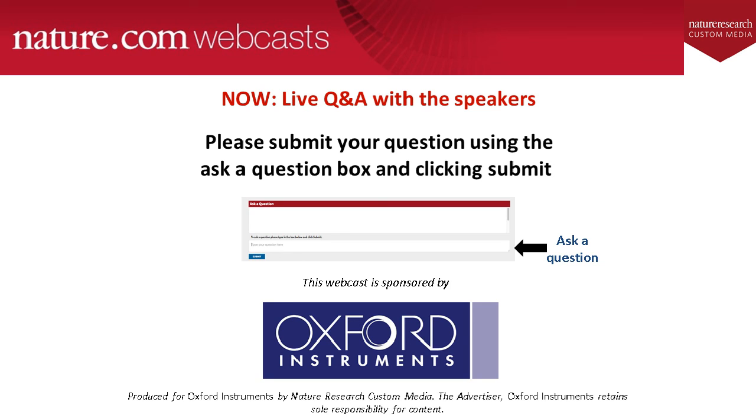So this, I think, is something I'd like to explore more. The example that I showed in the webinar was one where the APEX labelling was very strong. The osmium signal from the APEX reaction was quite strong. I think if you have a much lower density of osmium staining from APEX, using EDS could help you to screen the sample to find cells that may be expressing APEX, particularly if you have a low transfection rate.